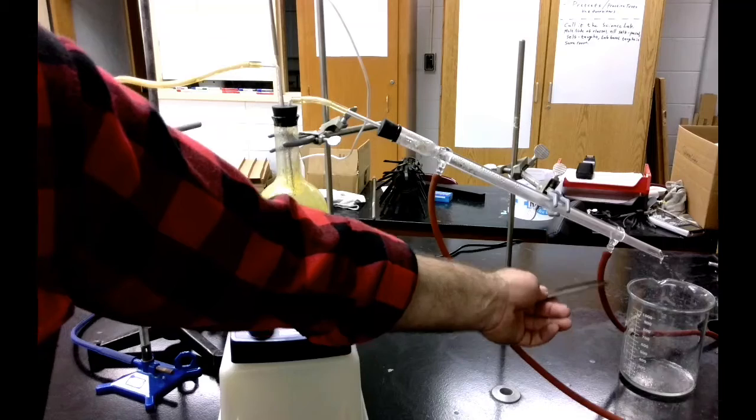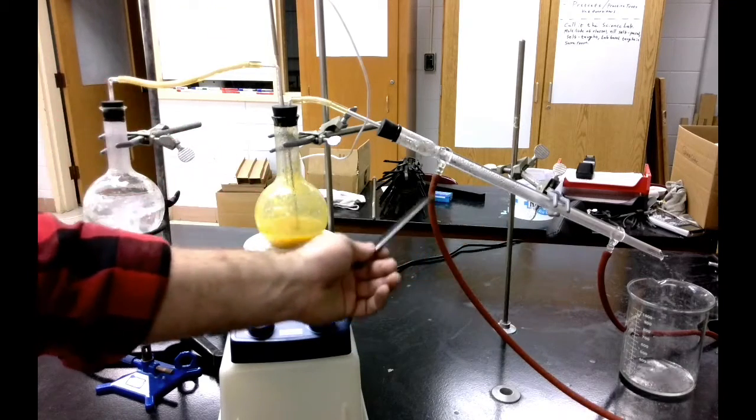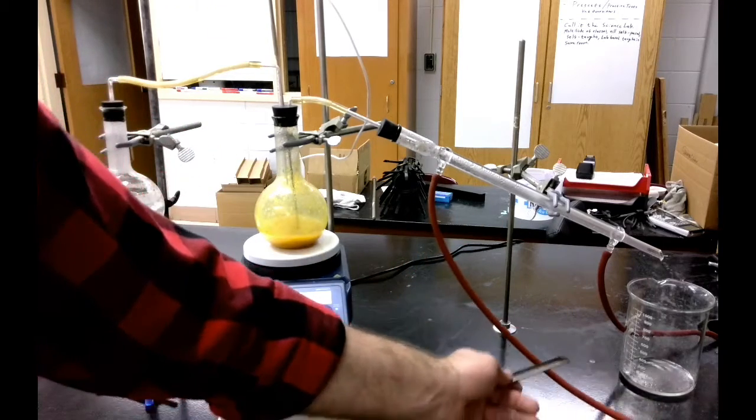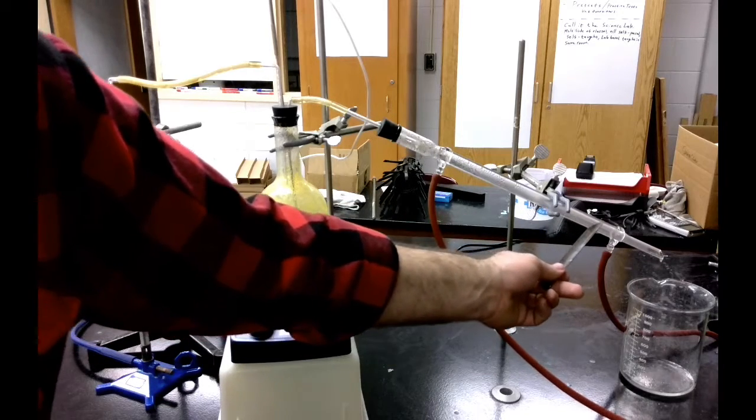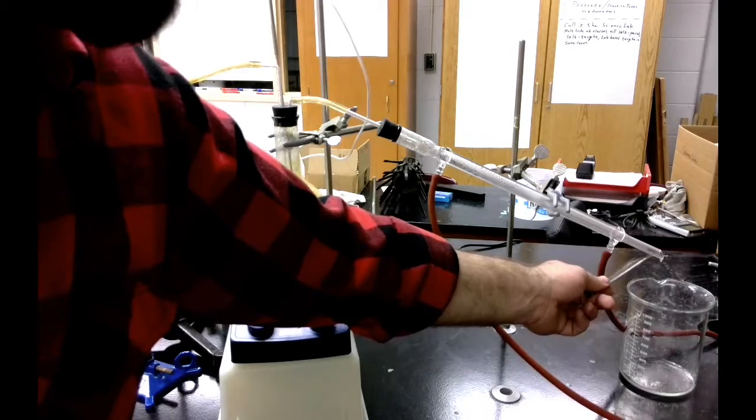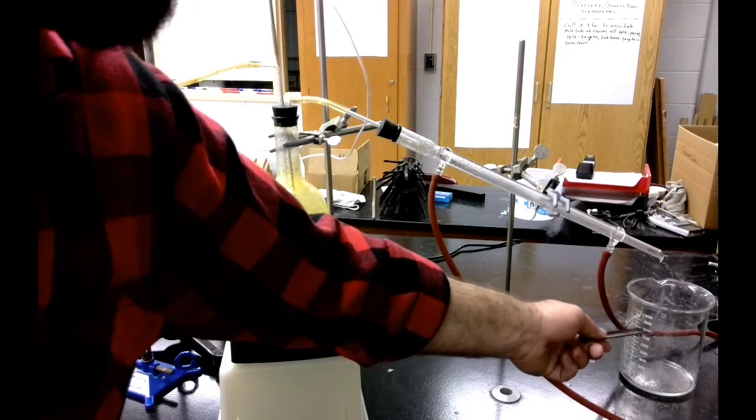So the water comes in through here from a faucet, and then it goes out through here back into the drain. And so by the time the gas is able to travel down the condenser tube, it actually converts back into a liquid and it drips out into my beaker here.